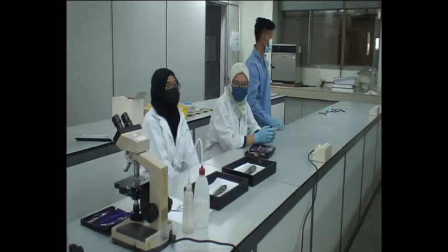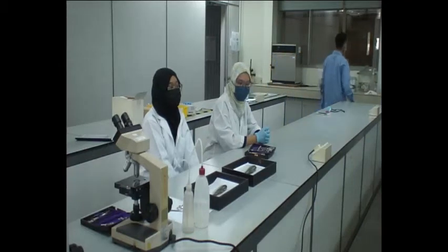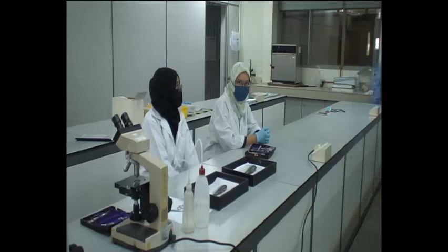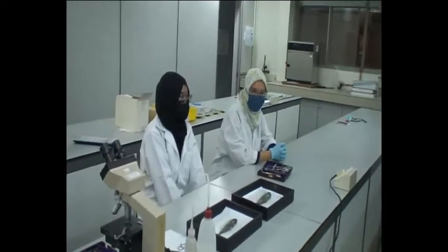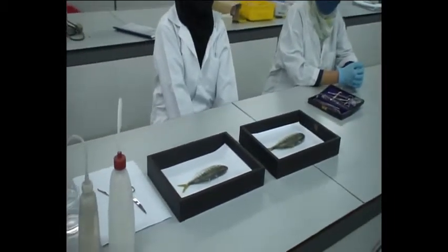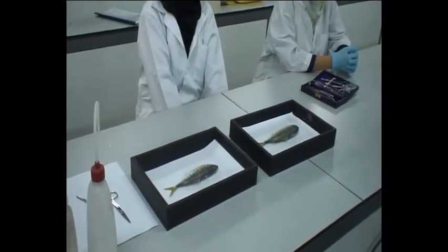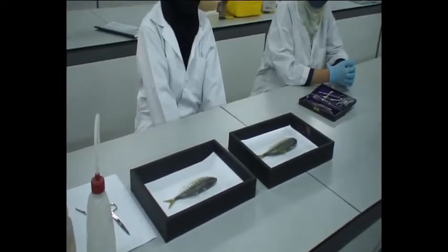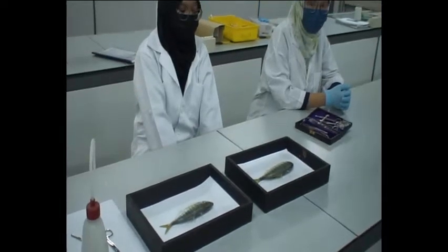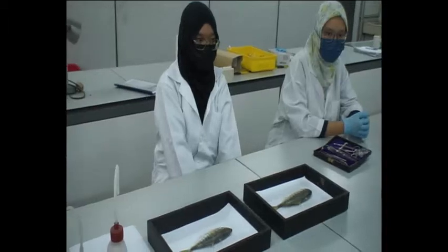First method, observe the morphological structures of the fish. Draw and label the structures such as head, body, tail, fins, which are the dorsal fin, pectoral fin, pelvic and anal. We also need to draw the eyes, mouth, operculum and lateral line. Observe the anterior part of the fish, particularly the coordination between the mouth, gills and operculum.